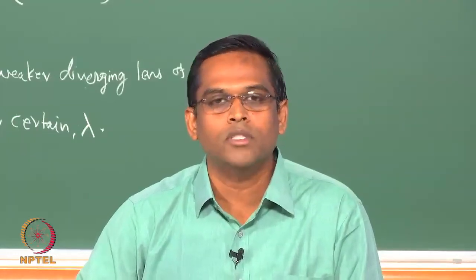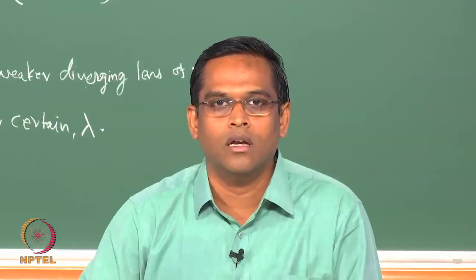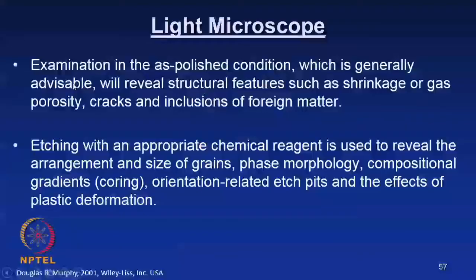Now, I am going to describe what a general light microscope does, and I will also take you to the lab and show some videos of actual light microscopes which we have in our laboratory. So, let us look at the description of a light microscope. Why do we use this light microscope?